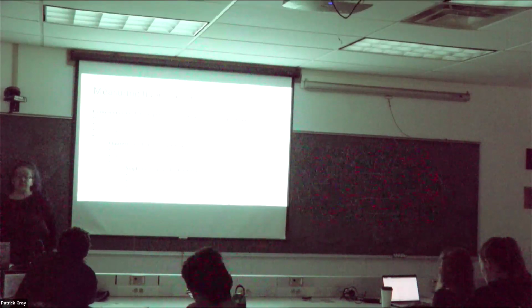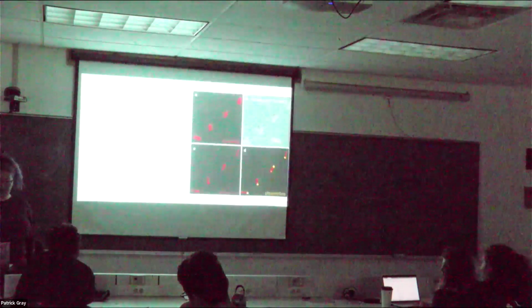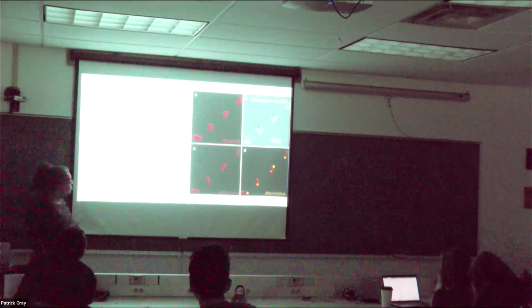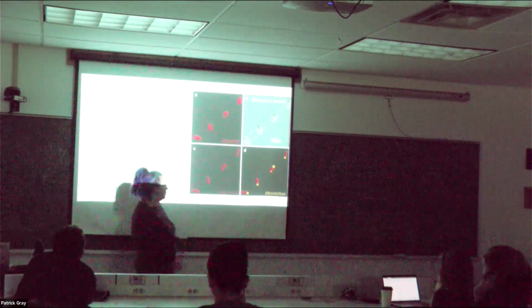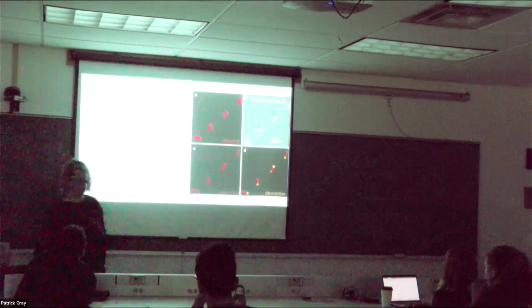If you were to build a phycoerythrin fluorometer, where would your detector be? So this is your phycocyanin and this is your phycoerythrin. Where would your detector be? Look at the color. These colors are real.